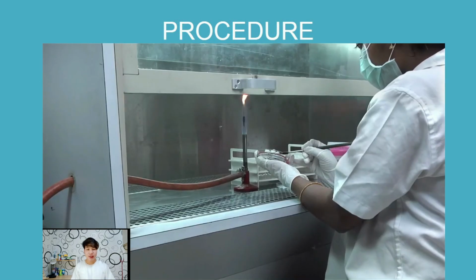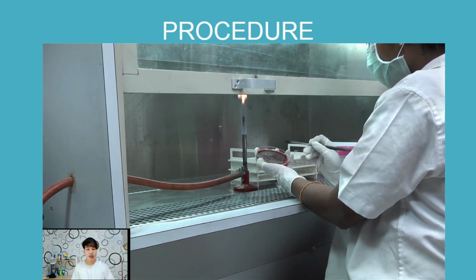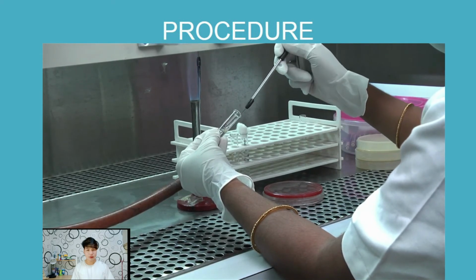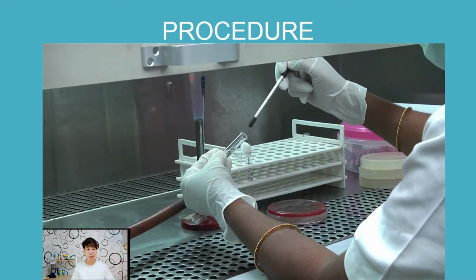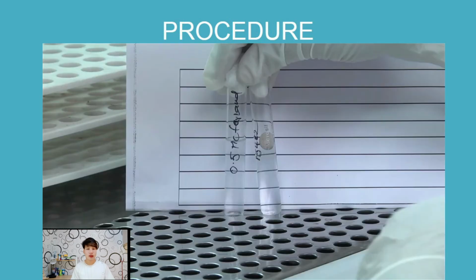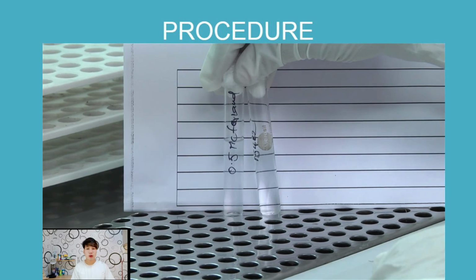Using a sterile wire loop, touch 3 to 5 well-isolated colonies of the same morphology and emulsify to the TSB or saline. Incubate the tube for 2 to 5 hours to produce suspension of moderate cloudiness. Match the turbidity of the suspension to the 0.5 McFarland standard in a good light. It is best read using white paper with black straight lines as background.